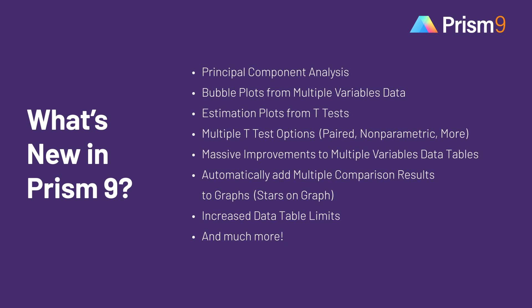Such as principal components analysis, bubble plots, and estimation plots, as well as major improvements to the performance of existing features, such as an expansion of the multiple variables data table and multiple t-tests, and important time-saving ease-of-use features, such as adding ANOVA multiple comparison results to graphs with a single click.